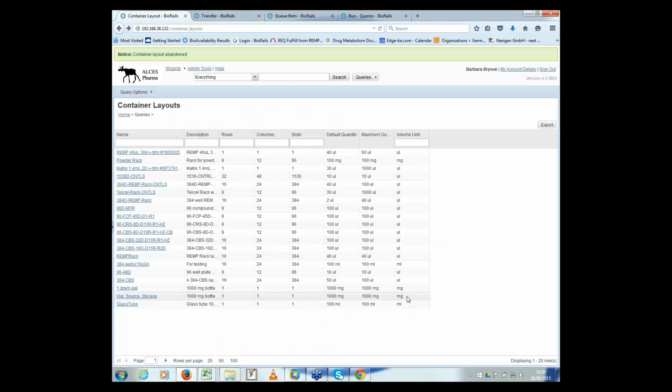Good. And then the next question, if you need multiple compounds but at different parameters, i.e. compound A is at 50 microliters at 100 millimolar, compound B 100 microliters at 100 millimolar, compound C at 100 microliters at 100 millimolar, can you request all these with the same submission, or does each compound need to be requested one at each time? No, so when you go through the request procedure, obviously the example I showed you was a highly standardized, higher throughput assay. So in that case, everything was at the same thing.